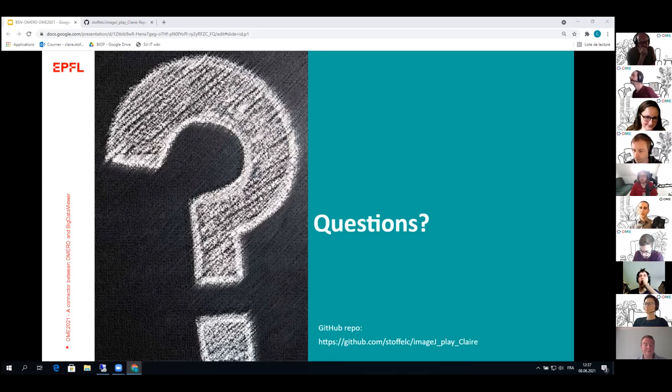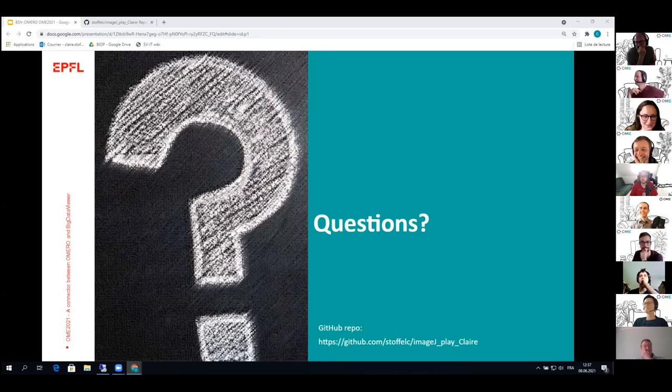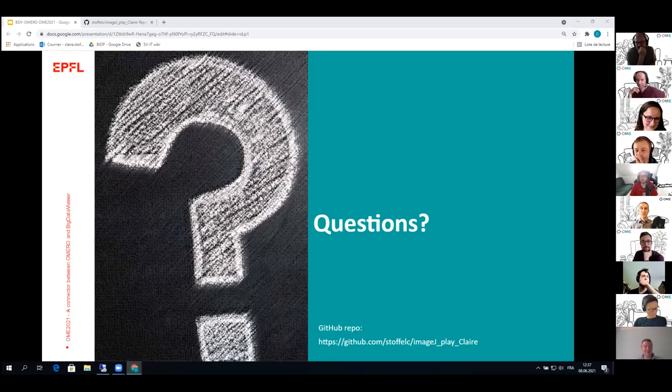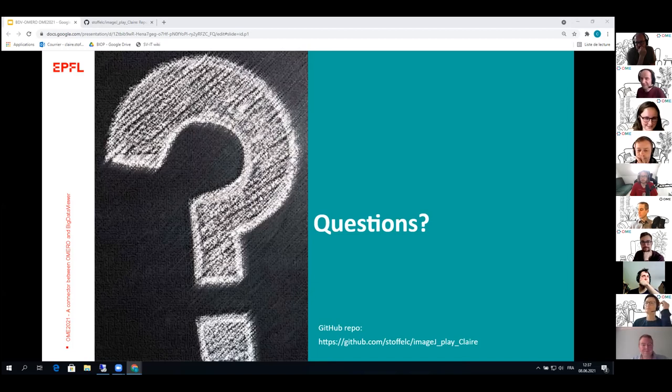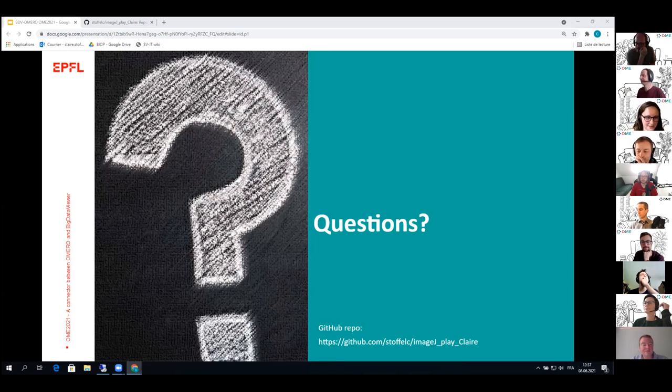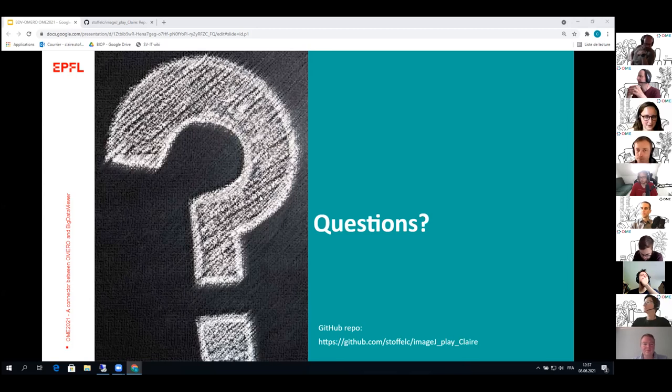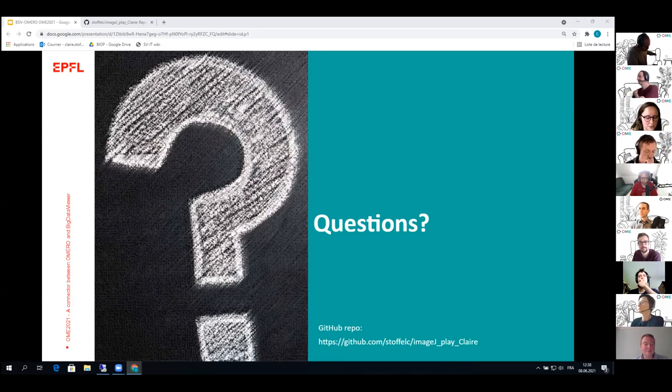So how do you feel about it? Are you ready for all these people who are watching to start using it? No, they may have to wait a bit for the tool to be ready. And at the moment, it's you download the jar yourself into Fiji or is there an update site? There's absolutely nothing. This is just I'm running this from IntelliJ. So I'm creating an instance of Fiji. But we will definitely consider as soon as we have a comprehensive version of it. We will consider to make an update site and make it available from Fiji. For sure. Very cool.